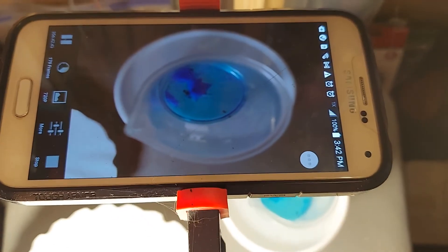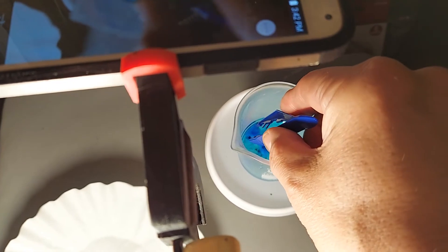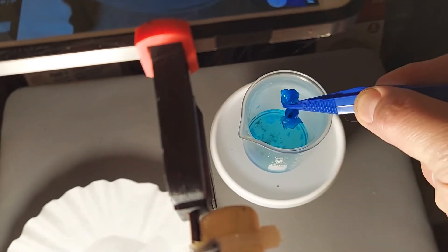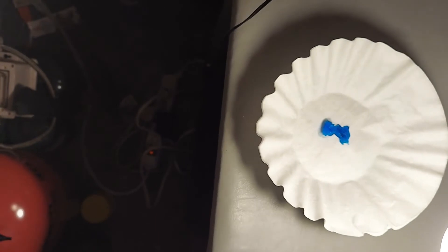As that continues to go through a time-lapse every two hours, I'm going to collect some of what's already formed in here. You can see one really beautiful crystal there of copper sulfate — copper combined with the sulfur ions from the sulfuric acid — and you get this. It's really something. I'm going to close up here because this is not focusing well.